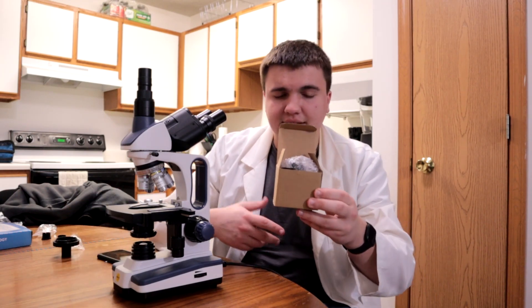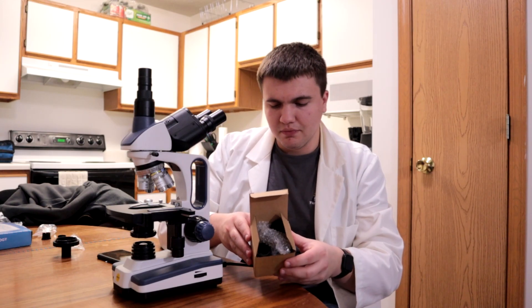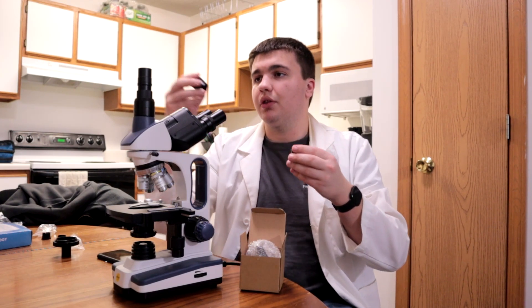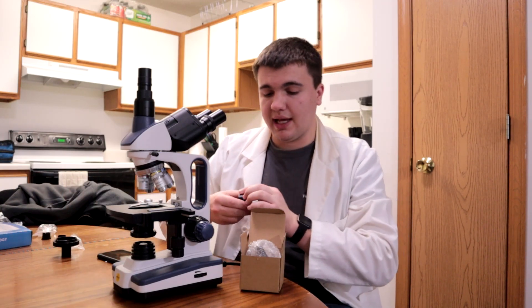As for the unboxing, it came in a package like this — just your standard Amazon bubble wrap packaging. No big deal. It came in a little box like this. I've already opened it. It was not taped shut.